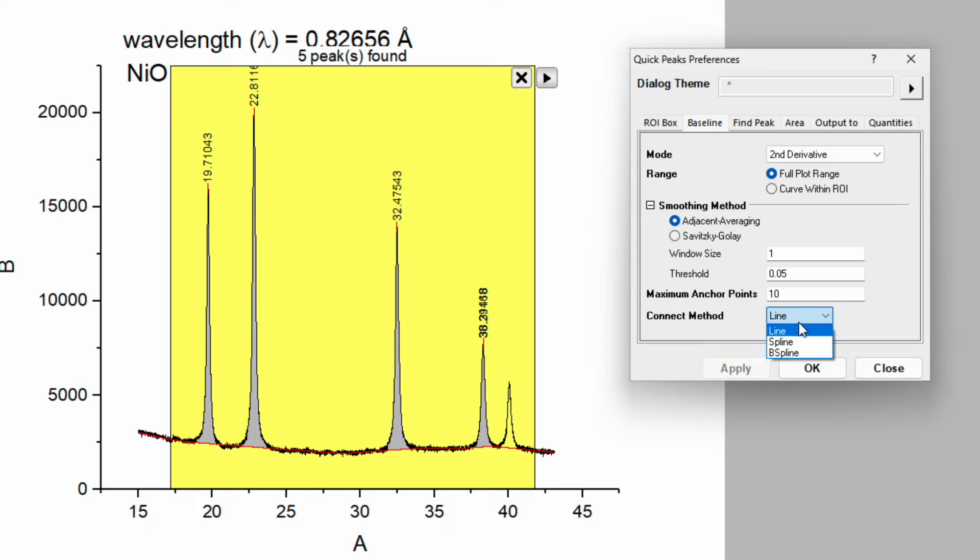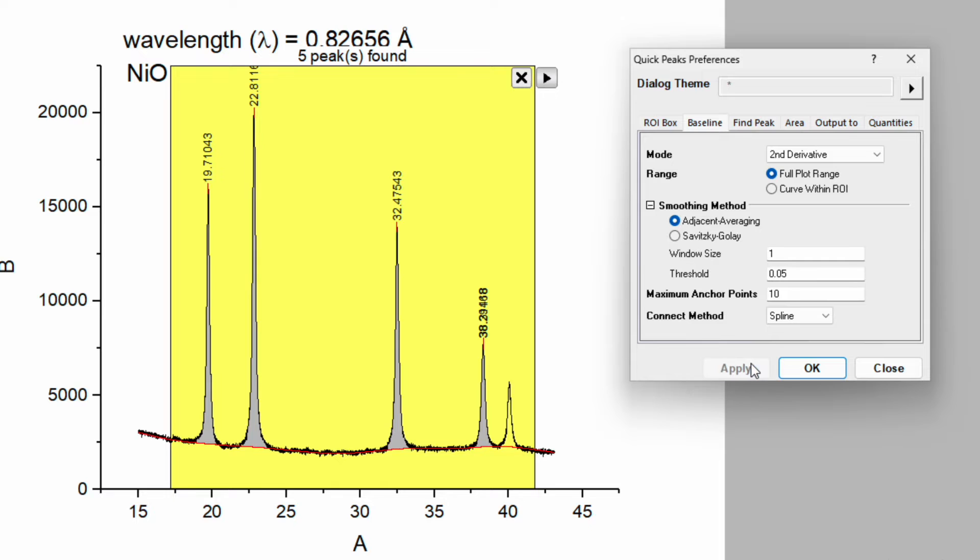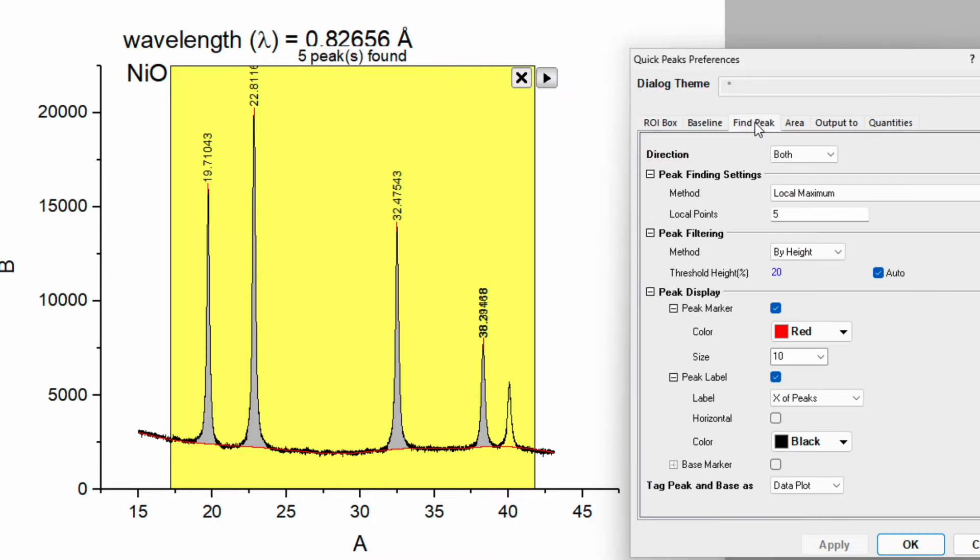Over here you can see connect method. So I will be choosing spline and apply. Then go to the find peak.